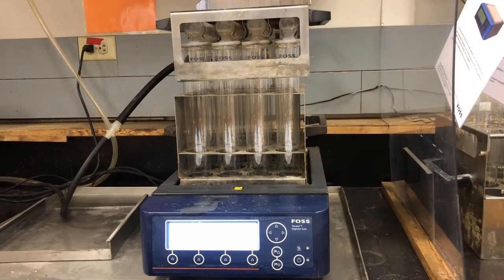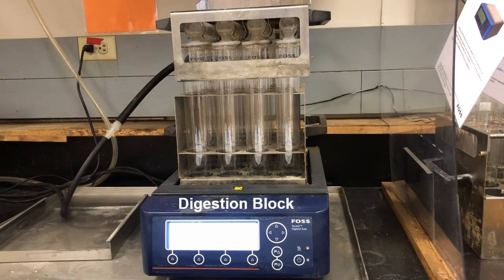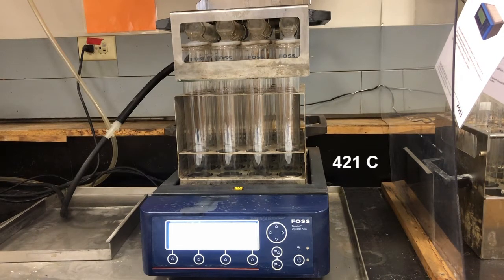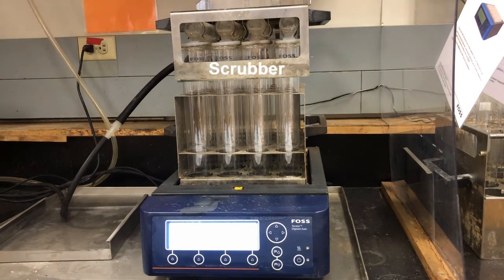Okay, so now we're over here at our digestion block. This is the digester, and you can see that our tubes with our samples in them have been placed into the heating block. Underneath the samples is our heating mantle, and that will heat up to about 421 degrees Celsius, so very high temperature. On top of that, you'll notice this piece of apparatus called a scrubber.